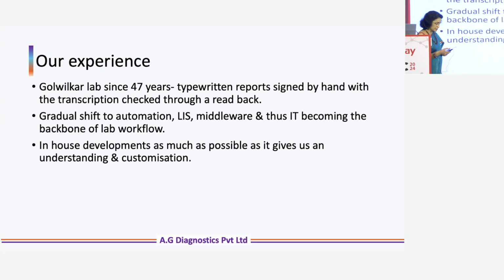So our experience: Golwilkar Lab, since 47 years, is a lab in Pune, and obviously it started off with typewritten reports signed by hand with the transcription check through a readback with the technician. The technician says T3 this much, T4 this much, TSH this much, then the data entry operator, then the authorized signatory, everybody is having readbacks, and then you actually sign out a report by hand. So this is how all of us have traditionally done it, even I, 28 years ago, was doing the same thing.